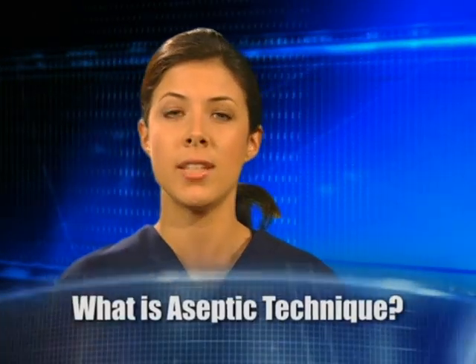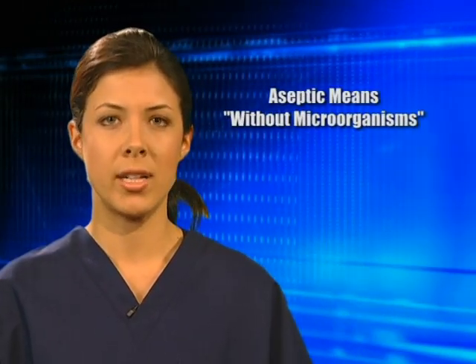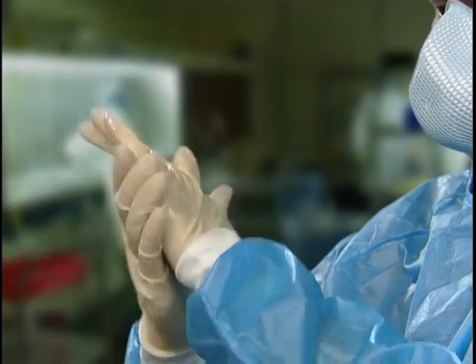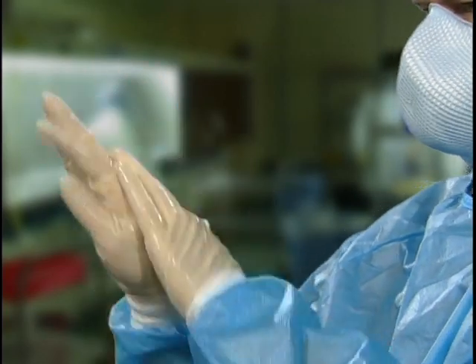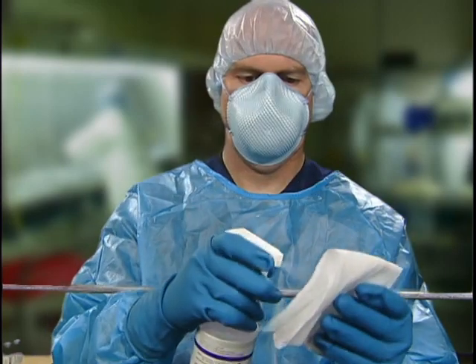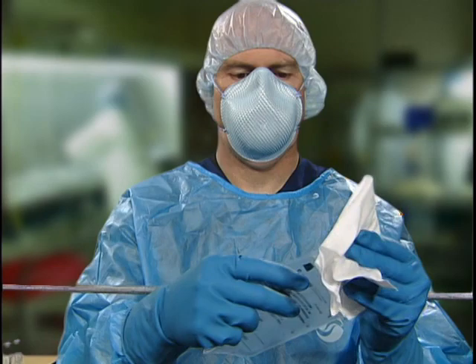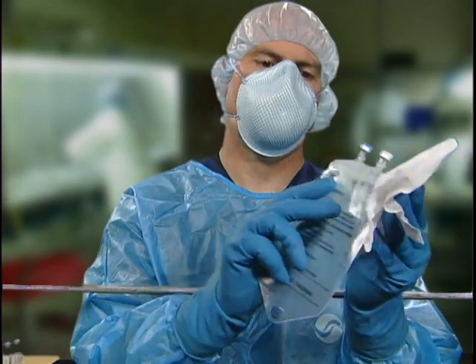Pharmacy technicians must be aware of the necessity for aseptic technique, cleanliness, orderliness, and accuracy in their work and work environment. Let's have a look at aseptic technique. Aseptic means without microorganisms. Aseptic technique refers to practices performed immediately before and during compounding that help reduce the risk of exposure to personnel and patients by decreasing the likelihood that microorganisms will enter the body.